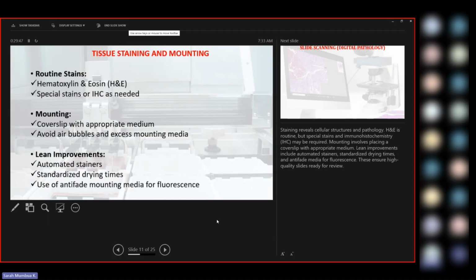If this doctor says you have this diagnosis, it's not like that is the final diagnosis. The patient can always request a second opinion. So if the slide has to be shipped to another lab or to another doctor, it needs to be preserved well. Once we're done with the mounting, we let the slides dry and they are ready for microscopy.